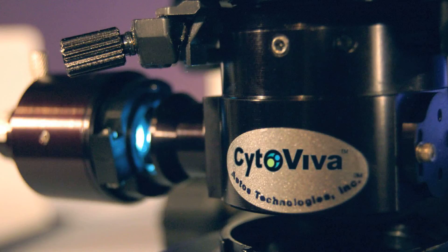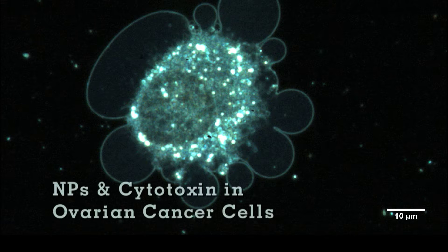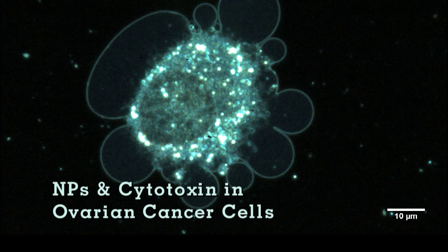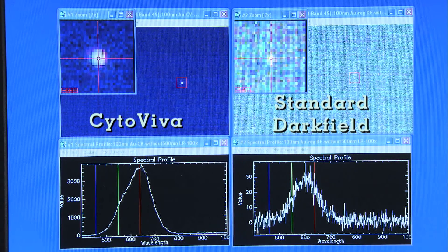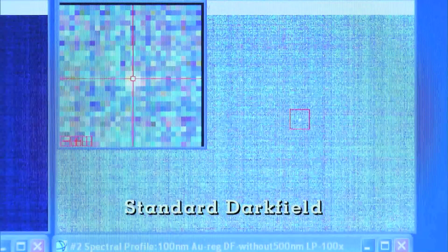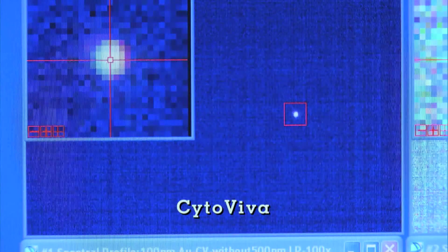CytoViva's high signal-to-noise optical illumination system replaces the standard condenser on a research-grade microscope. This system serves to perfect the alignment and focus of oblique angle illumination, also known as darkfield. The signal-to-noise enhancement improves detection as much as 80 times compared to standard darkfield microscopy.